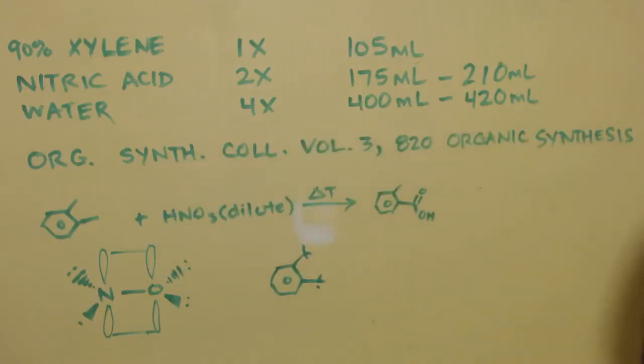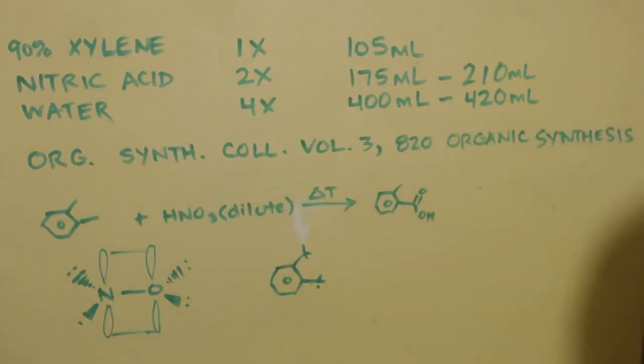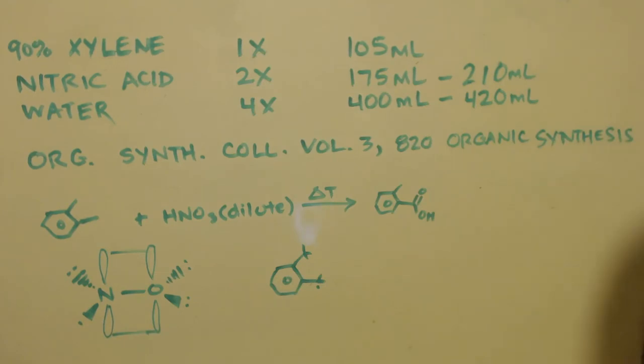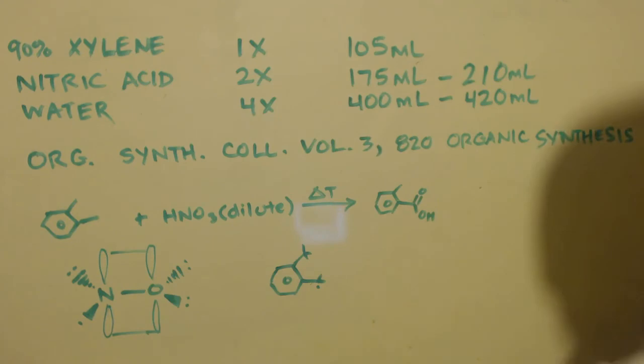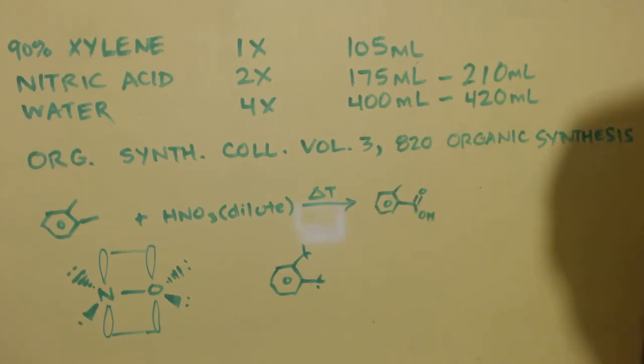This is the actual thing on Google. This is the generic equation. I really don't know the mechanics. I believe, but I'm guessing, that it has something to do with the NO gas, not the NO2. The NO gas is kind of like a radical. It only has 1 electron there that's not shared. The only thing I can guess is that it would go to the xylene. These 3 spikes here are hydrogens. These 2 spikes are hydrogens. And then it would come and take a hydrogen off of there. The benzyl hydrogen would be my best guess. It's the easiest thing to pluck off. What happens after that to make it into toluic acid? I don't have a clue.